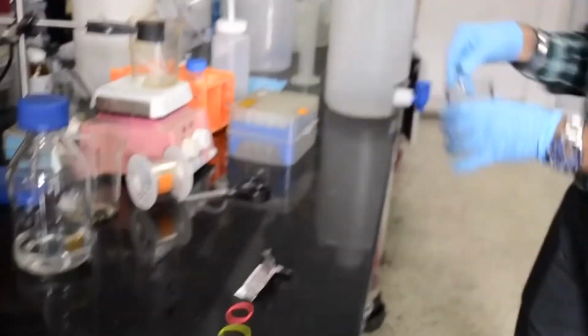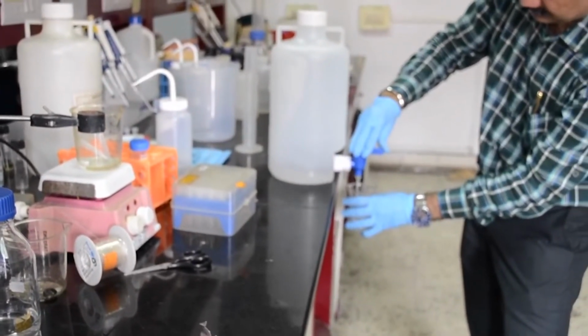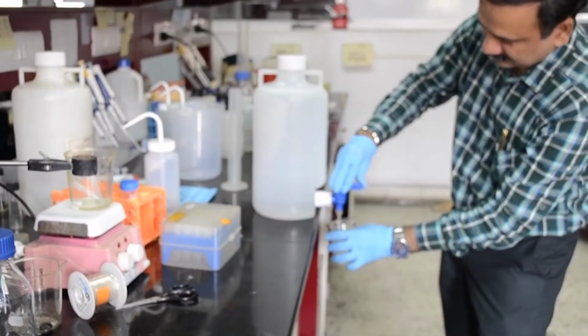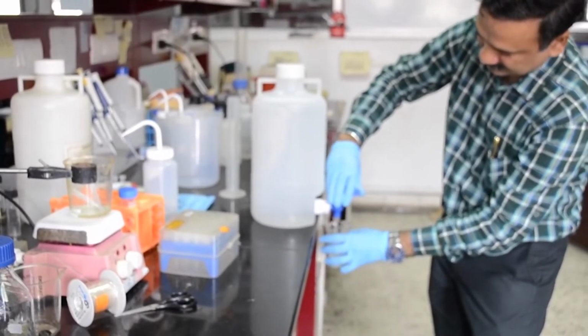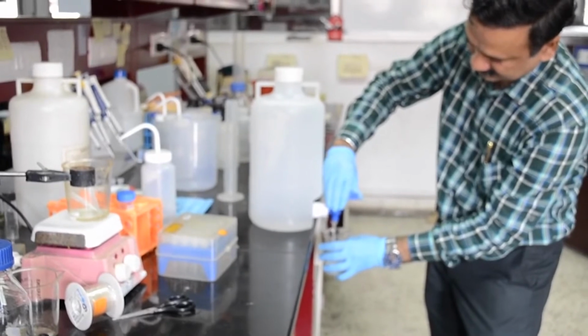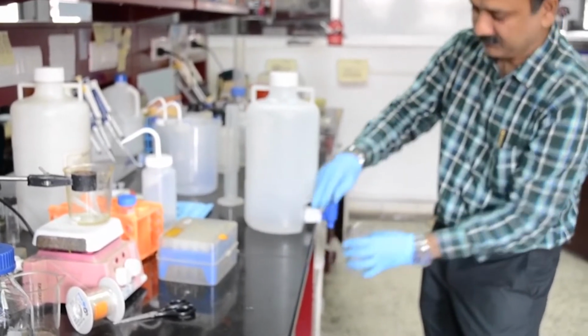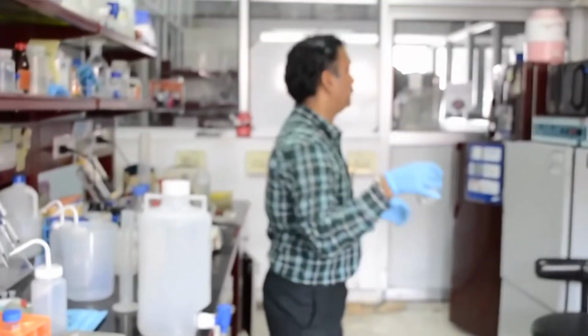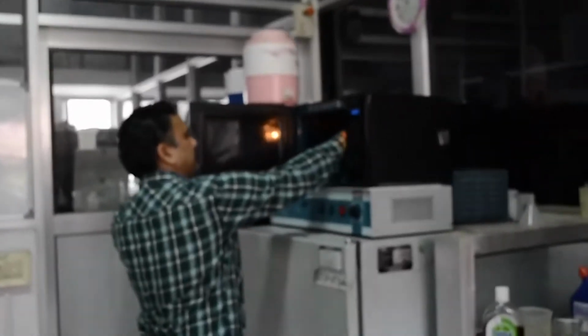Then you put this into a microwave so that it will warm up.